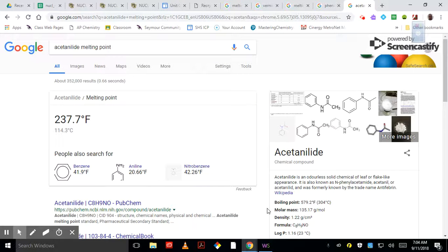Good morning. We're going to be investigating laboratory experiment number 3, the identification of the unknown from the second lab. This would be the material that you claimed from the dichloromethane. Most of you have it in the desiccator at this point. And what we're going to do first is make it better.